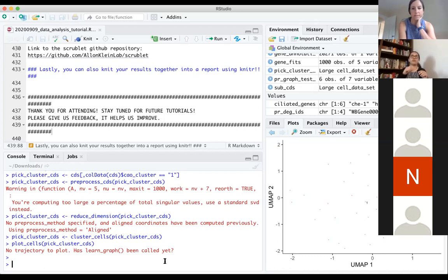that you could try is when you plot the trajectory, you can subset the trajectories and check for gene expression in parts of the trajectories instead of the whole thing at once, so that you see more subtle results, I could say. Does that make sense?